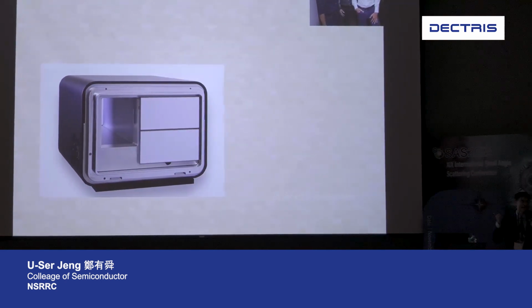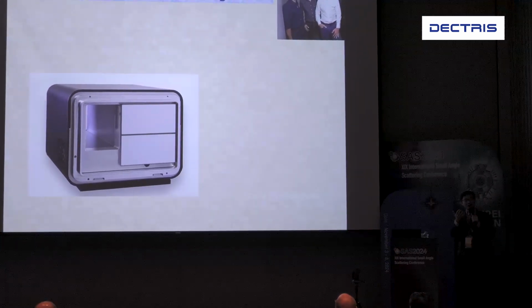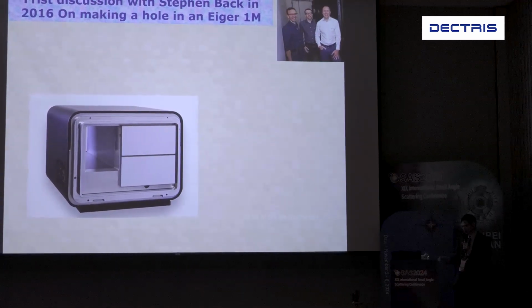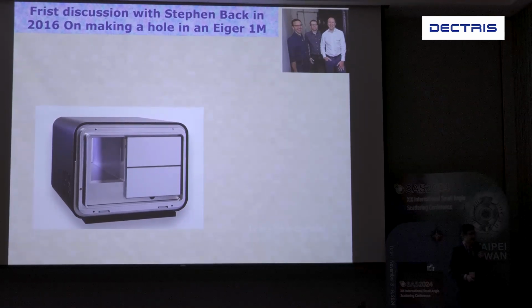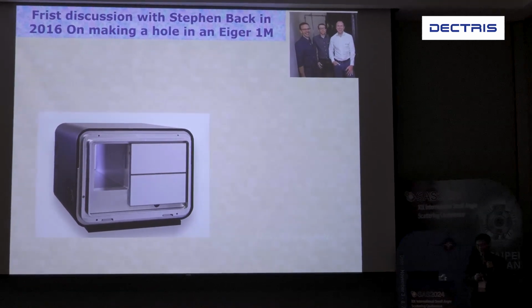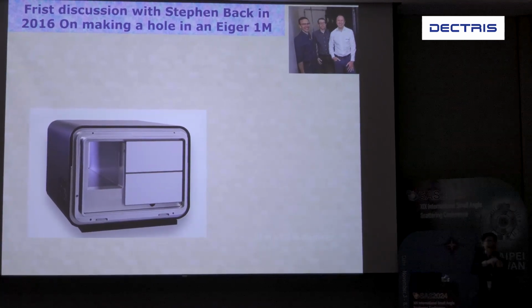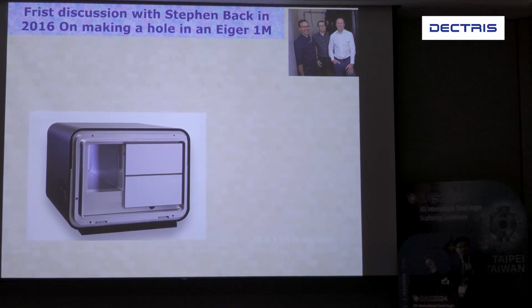And then we started to talk to the DECTRIS people. Well, you want to have 2 detectors, you have to have light pass through the first detector. So we requested, can you make a hole here? It took 2 years to get it through. Finally they said, okay, we'll make a hole for you. So that's the first hole detector. But nowadays you can get any kind of cut you like. But that was the beginning, back in 2016.